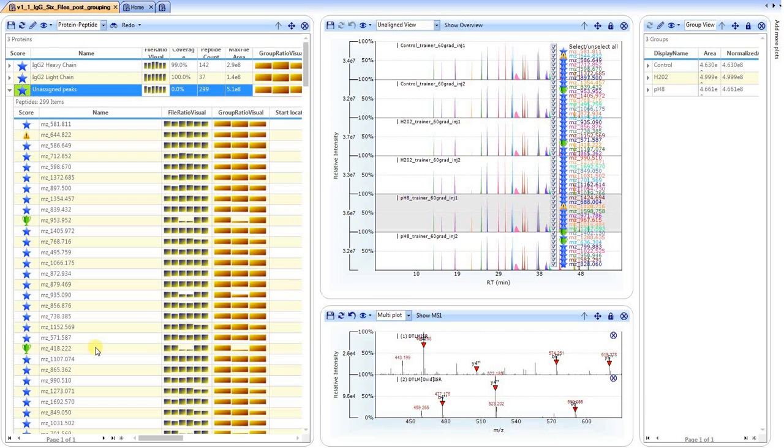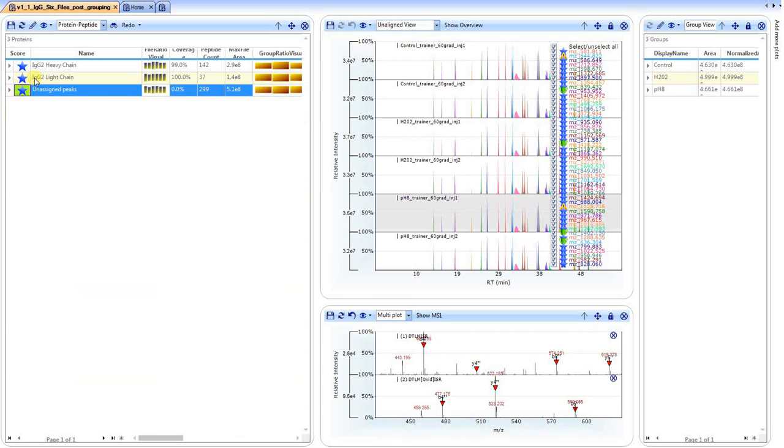And of course, the other aspect in total characterization is not only which peptides you are interested in, and the sequence coverage for the heavy and the light chains, but we also have ways to change the different views. And one particular view that is extremely beneficial for antibody characterization is this protein PTM view.